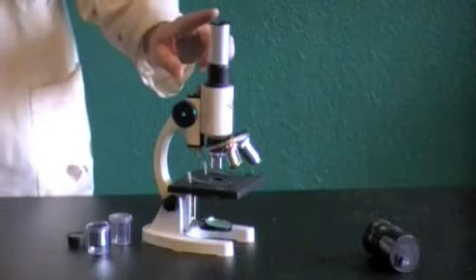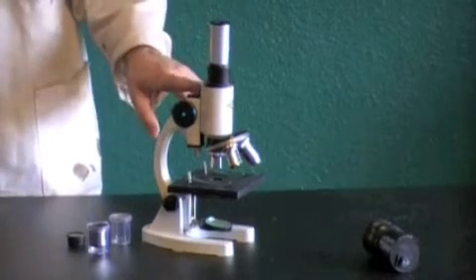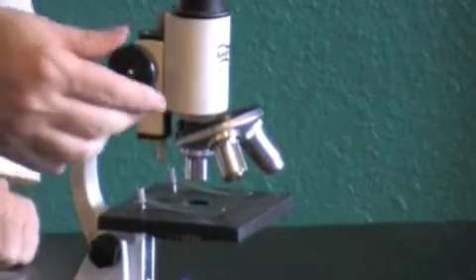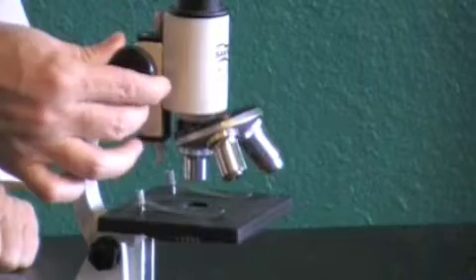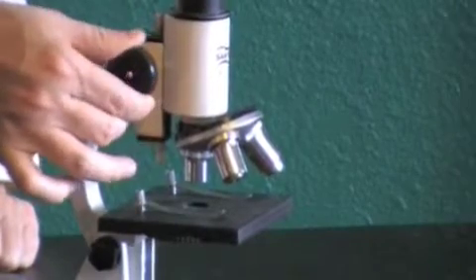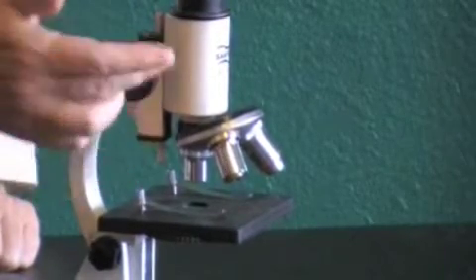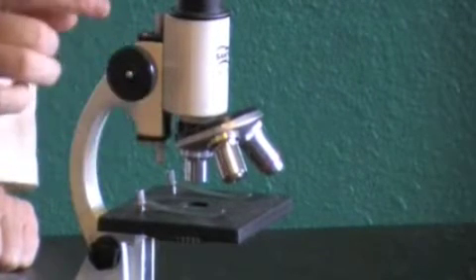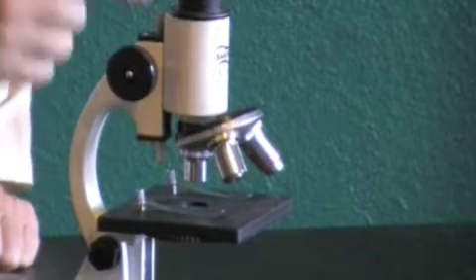Now moving down from your ocular lens, we're going to have the focusing knob. So this is your focusing knob. Turning this adjusts the lenses so that you can adjust the focus. You're going to need to move this up or down to find your focus for whatever you're looking at.